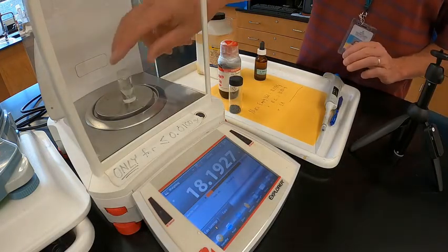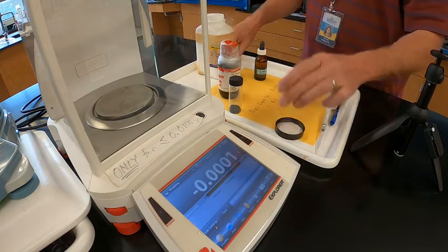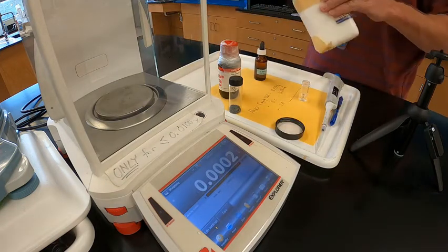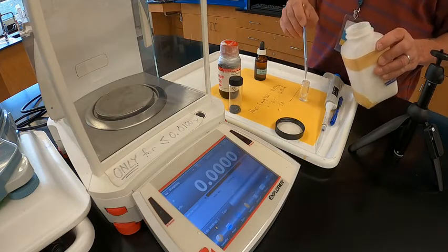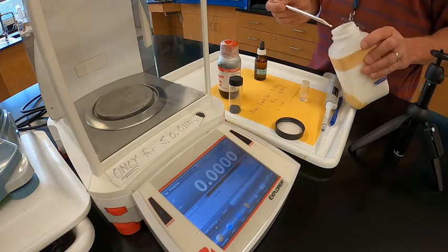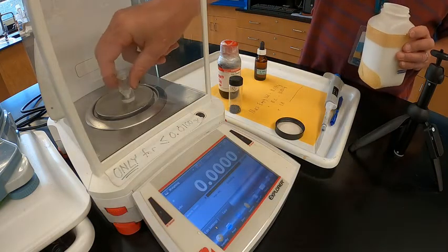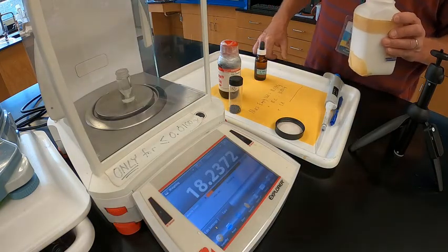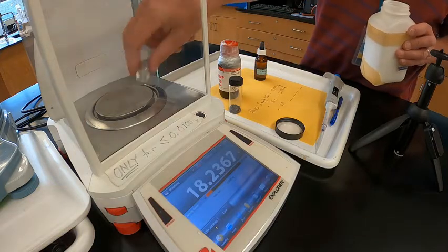Now I want to add as close to 0.15 grams, or 150 milligrams, as possible. So take it back out. I'm going to add a little bit, and add a teeny bit more, and check to make sure that I'm close. I want to have about 18.34, so I need a little more.